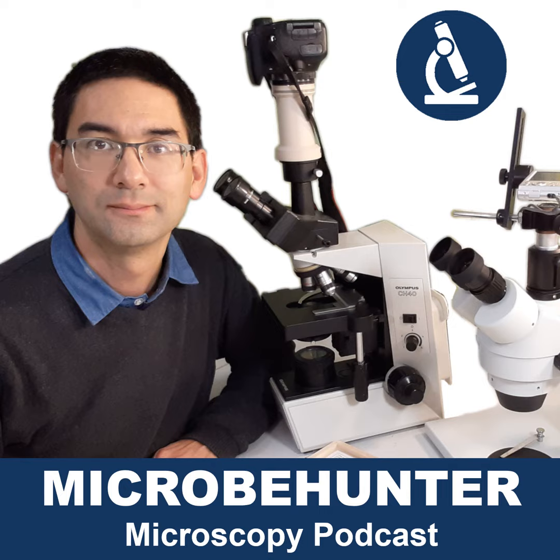One last thing maybe: how do you actually recognize an infinity microscope? There is an infinity sign on the microscope objective. And if the number 160 is written on it, then this means that it is the 160 millimeter DIN standard. Okay, so that is pretty much it.